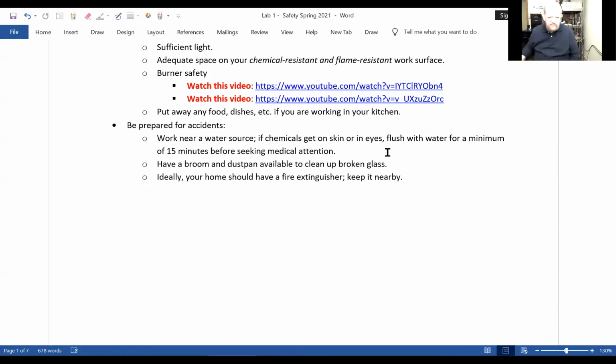And I teach in the lab, and in the video, that the instructor should always clean up broken glass. If you ever do it, use a broom and a brush pan, not your hands, because you'll cut yourself. And you should be taught in the lab, and in the video, how to use a fire extinguisher. Now, important thing for using a fire extinguisher, and you should have one in your kitchen for sure, the dry chemical: if you have a fire, always spray at the base of the fire, not the top, and that will help put it out.